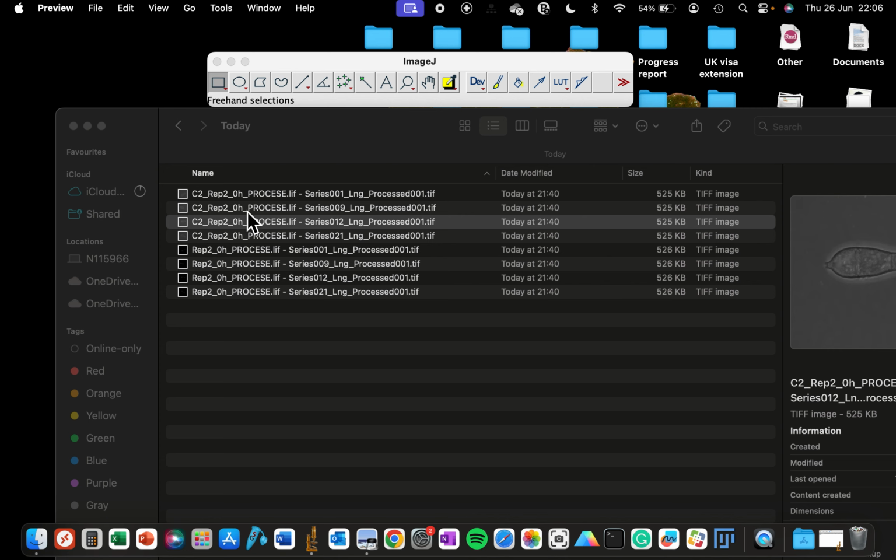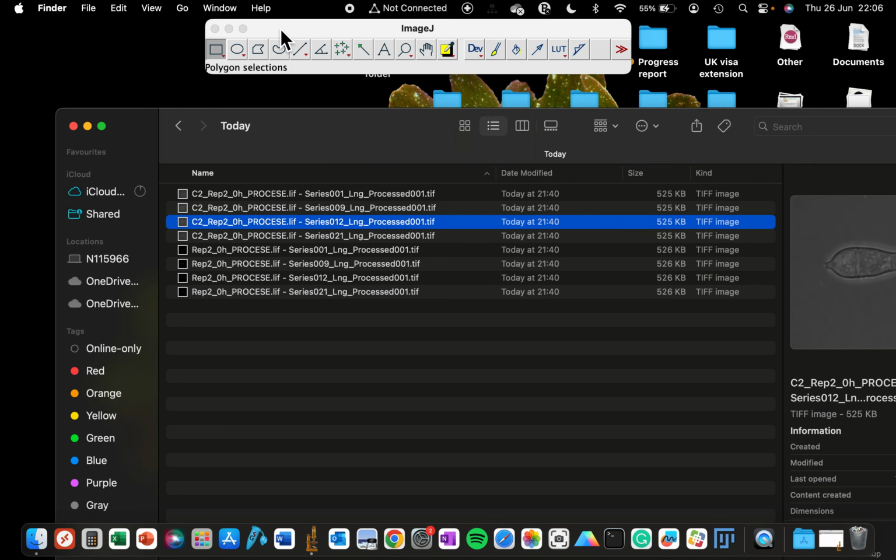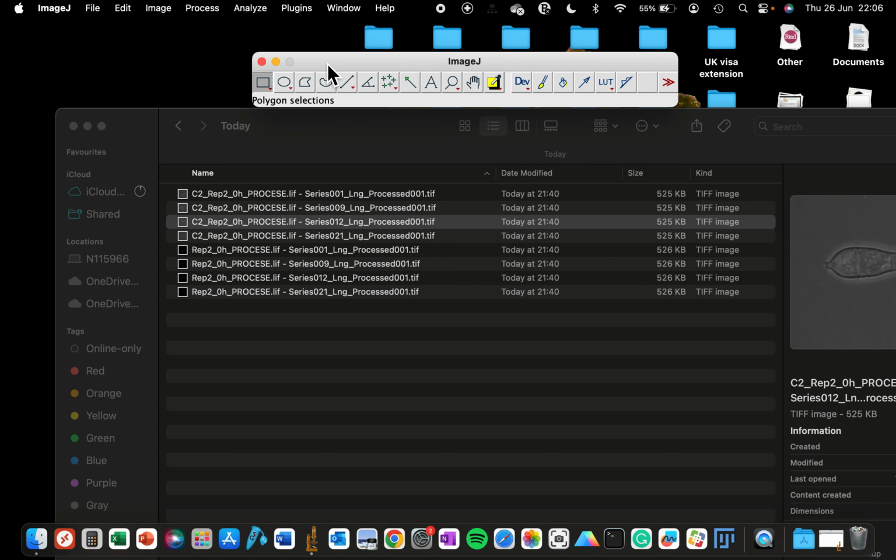If there are other analyses that you need to do, maybe crop certain images with a certain dimension, you could also use this particular workflow for it. Or if you need to change the display color, let's say when you exported your microscope images, you displayed your lookup table as red, and now you want to display it as magenta so that colorblind people can also see those images. You don't have to be doing this one after the other. So without me boring you with too much information, let's go straight to this tutorial.